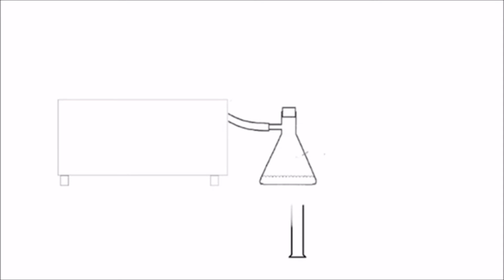The apparatus for vacuum filtration was prepared, and the resulting copper compound crystals were filtered. The crystals were washed with 10 ml of ammonia-ethanol solution twice, 10 ml of 95% ethanol twice, and lastly with 10 ml of acetone twice. After that, the crystals were collected in a beaker and covered with filter paper. They would be used in part B.